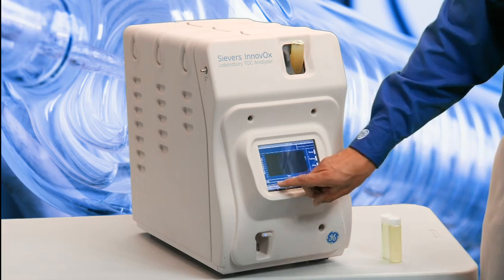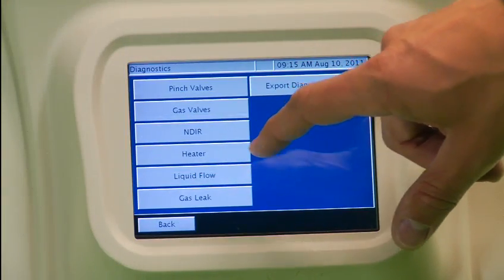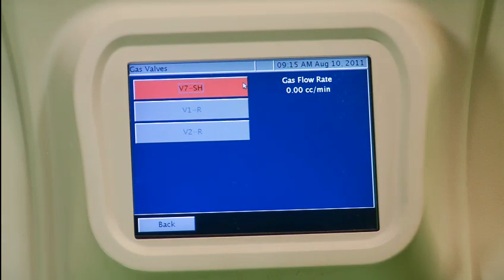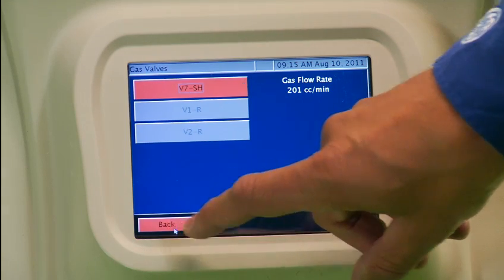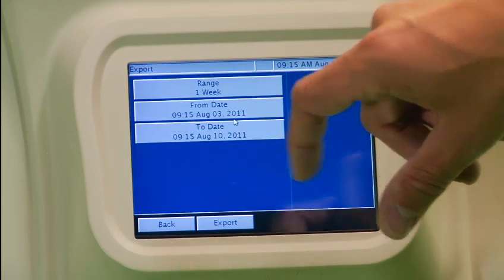This intuitive touchscreen interface makes navigation simple. Convenient onboard diagnostics give you insight into system performance, such as gas flow rates. The Data Review and Export screen gives you many options for further data analysis.